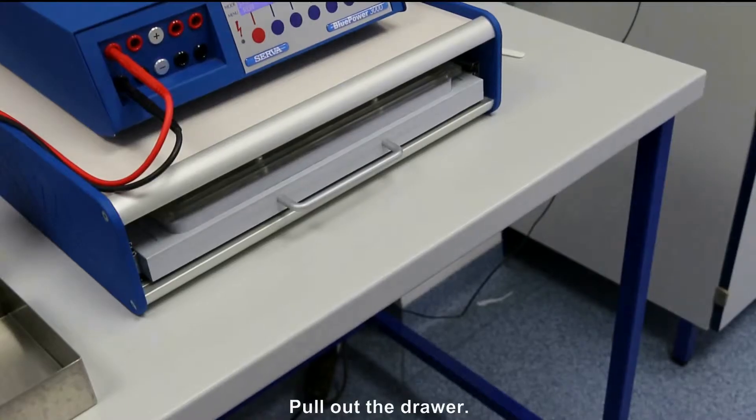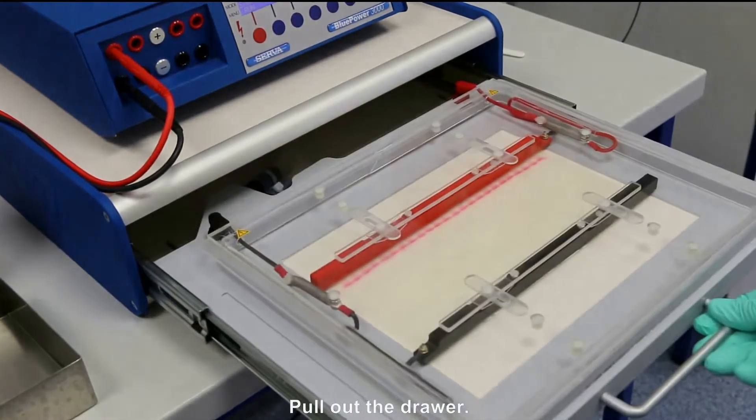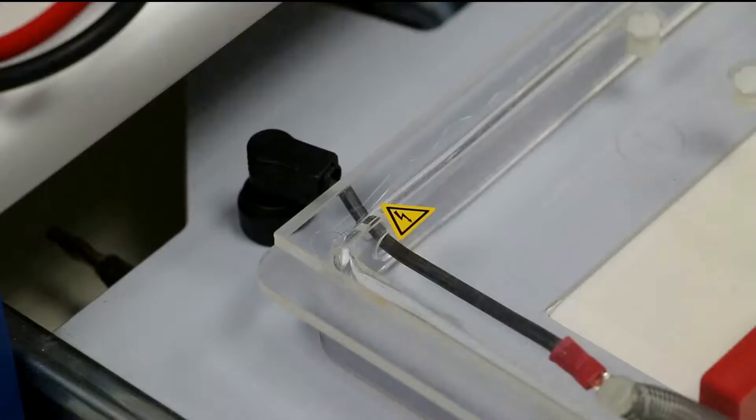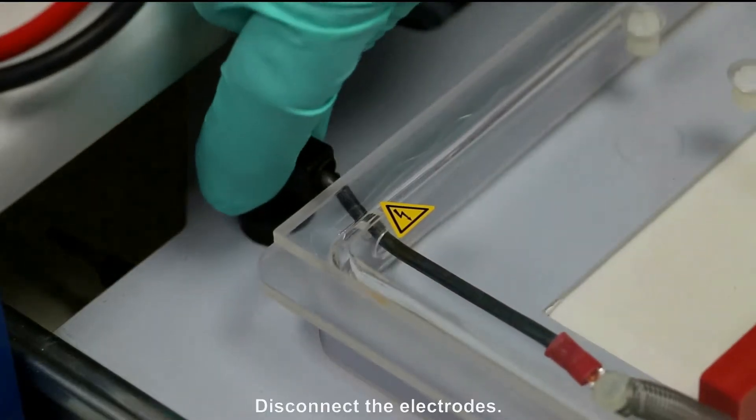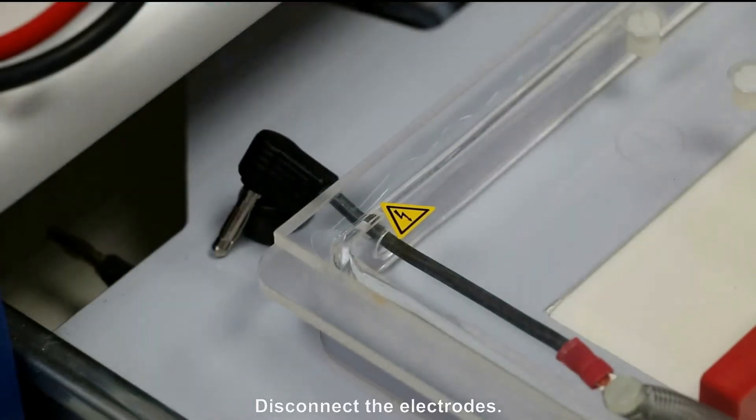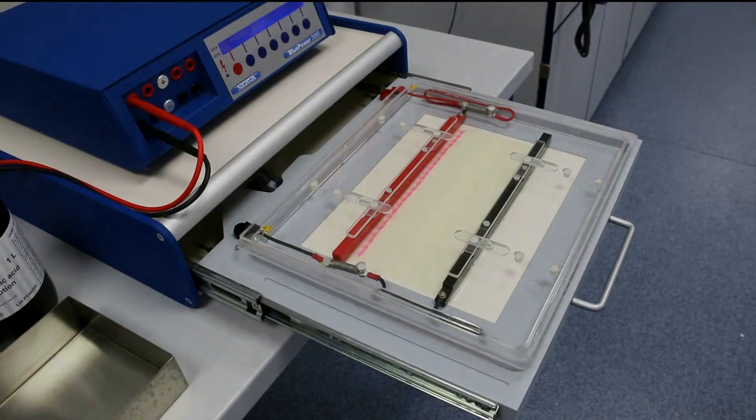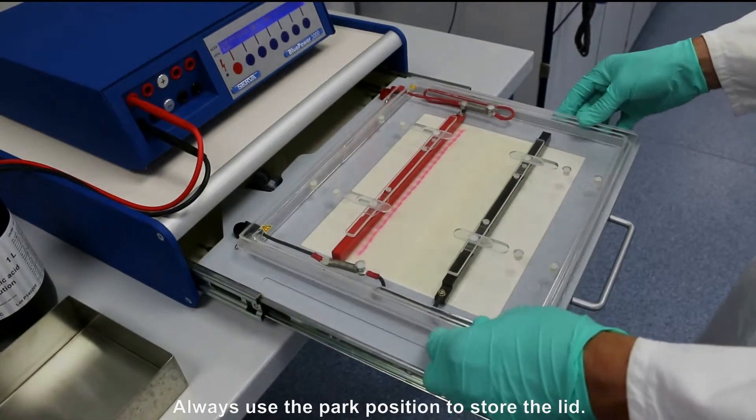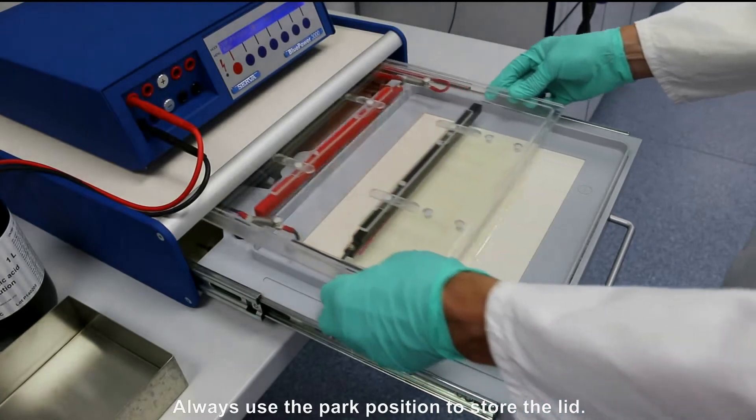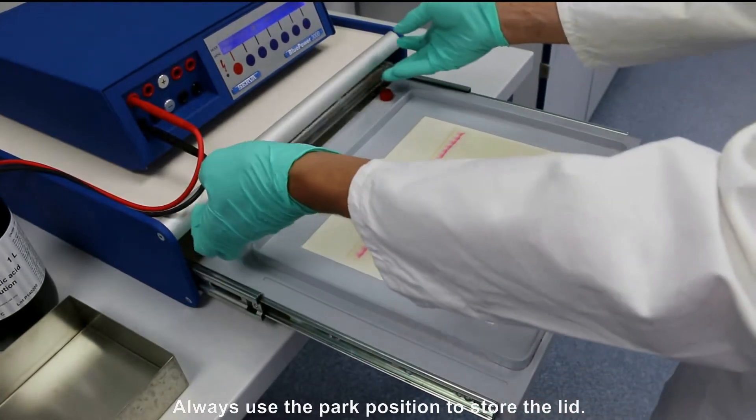Turn the power supply off. Pull out the drawer and disconnect the electrodes. Remove the lid. Always use the built-in park position for secure storage.